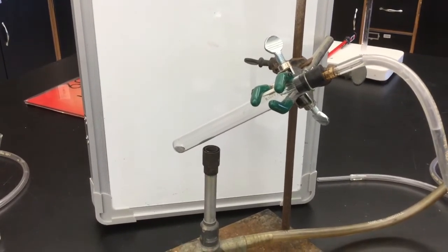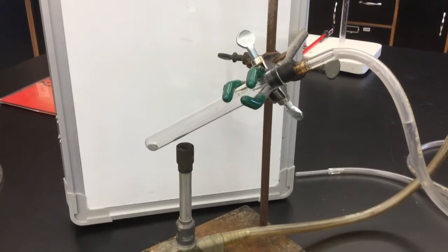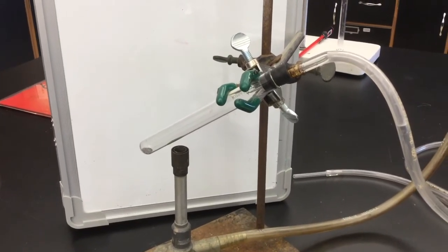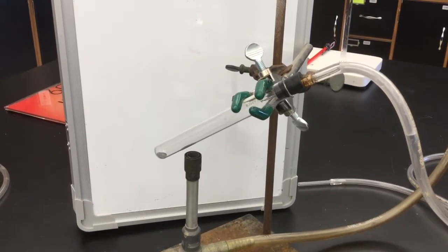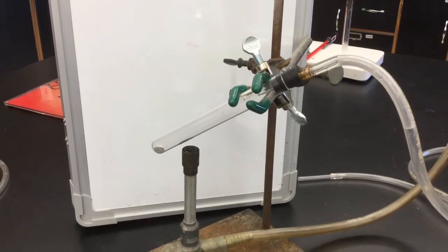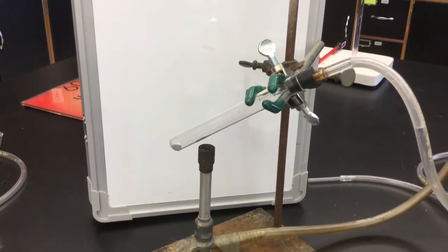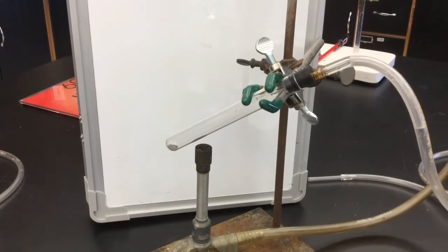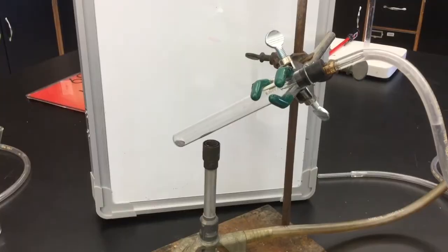Check the placement of your test tube. You want to make sure that you are heating at an angle. This provides the most surface area to be heating and is also the safest way to heat this. The top of the test tube should not be pointed at a person. We also want to make sure that we clamp near the top of the test tube so that the flames are not being directed at the clamp, as the plastic around the clamp may melt.